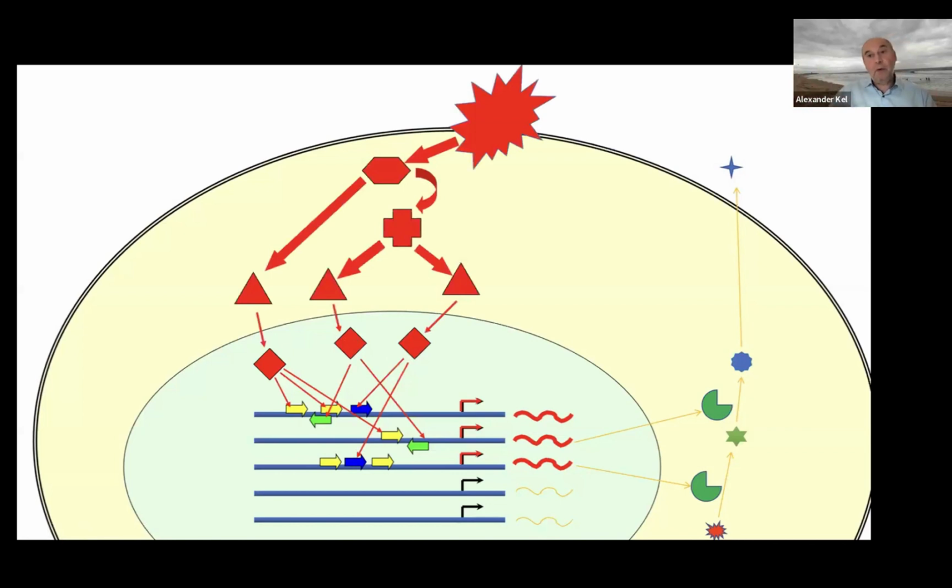And then we go more upstream. We're calling it upstream analysis. We are trying to ask a question: are there any master regulators which might regulate the activity of all these transcription factors altogether? And once we found those master regulators, they might be very good potential drug targets, if we are talking about some pathologies we are analyzing.